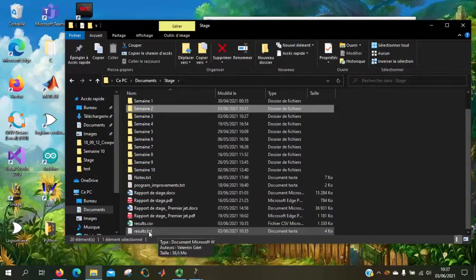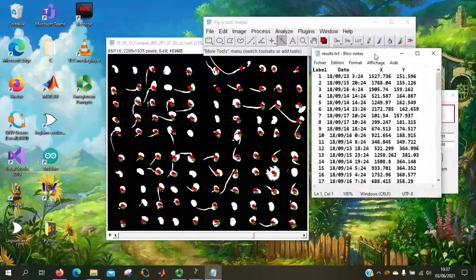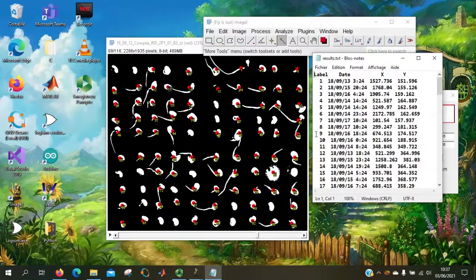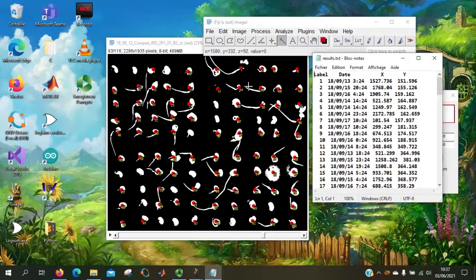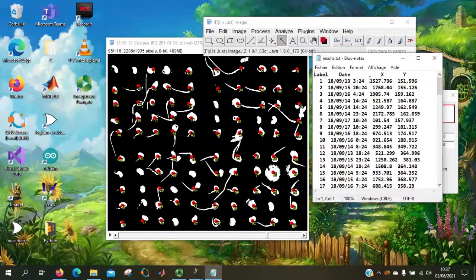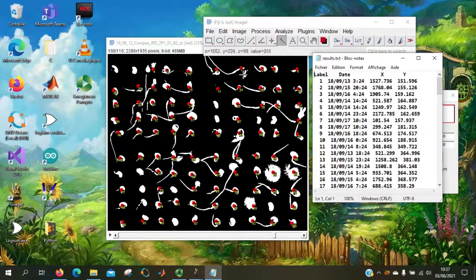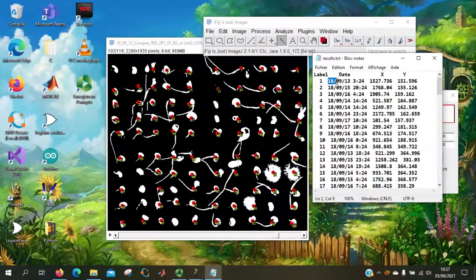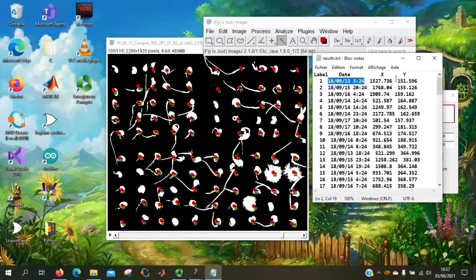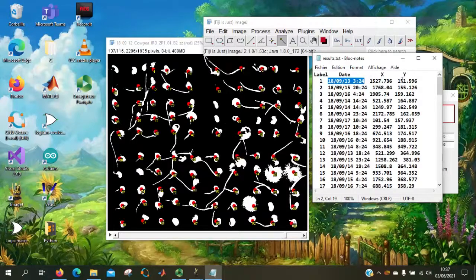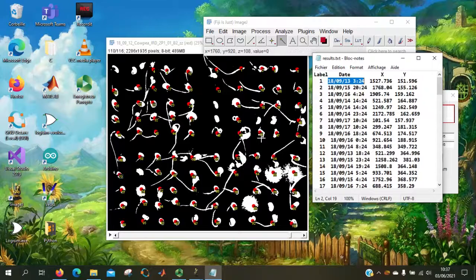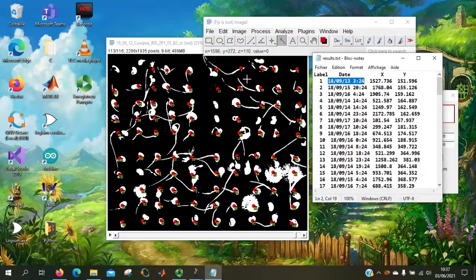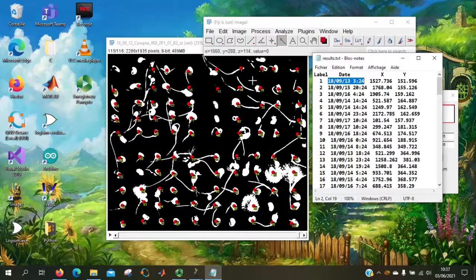So this is the file. So here we can see the label corresponding to those ones. And we have here the date of germination of the seed. For example, the seed is germinated at a specific date. And this is its position on the image. And it's pretty accurate.